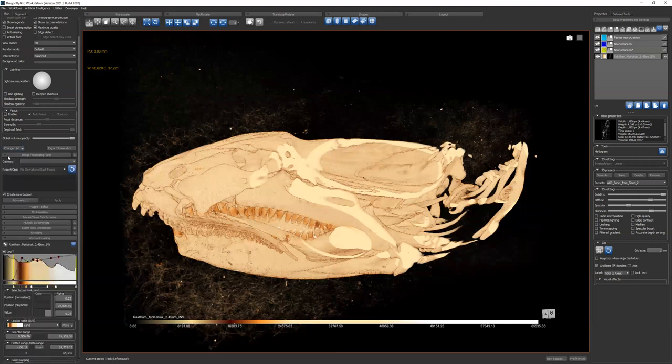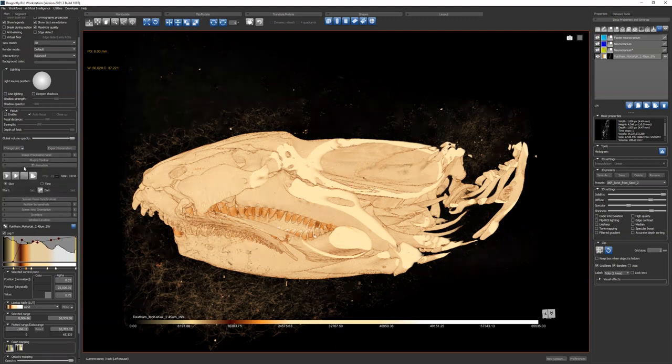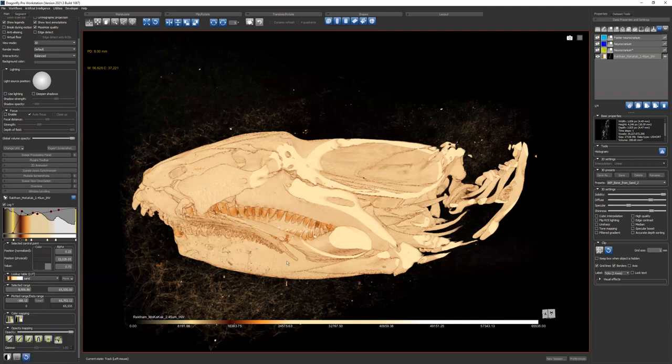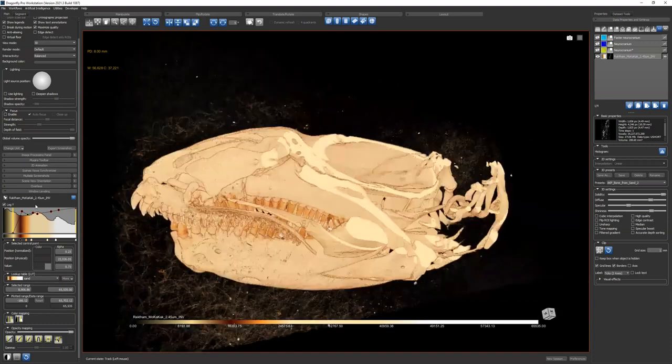Image processing panel. I think you can get really involved with a lot of this stuff, but I haven't delved too much into it at all. You can make videos, which we did the other day, and I don't remember how to do right now. So that's another video, how to make videos.